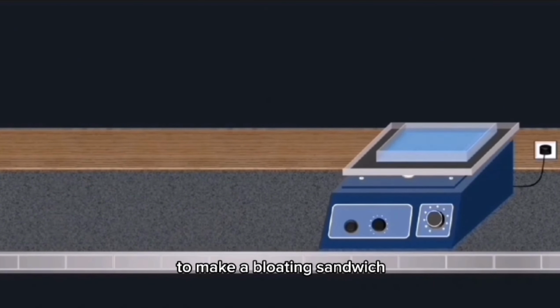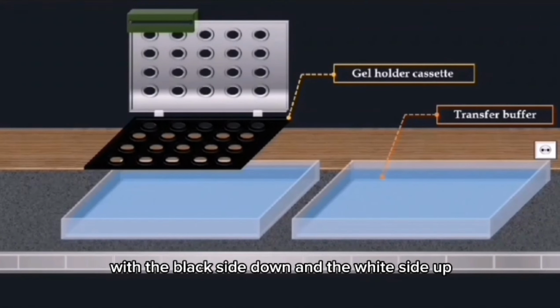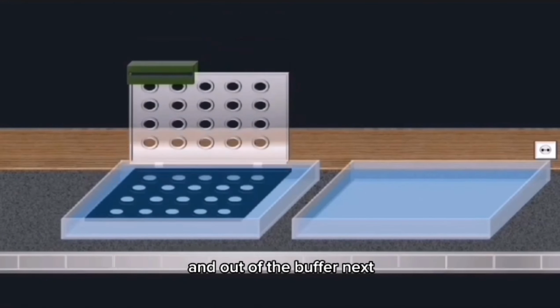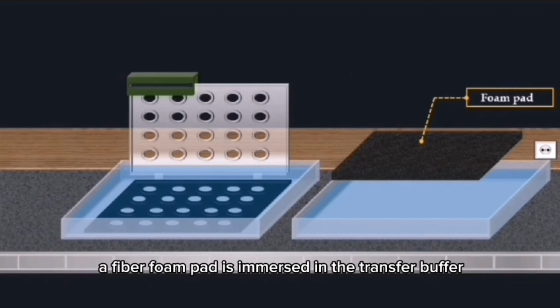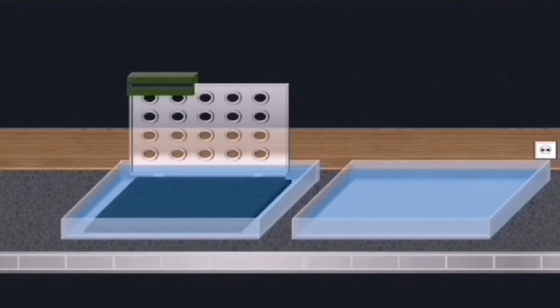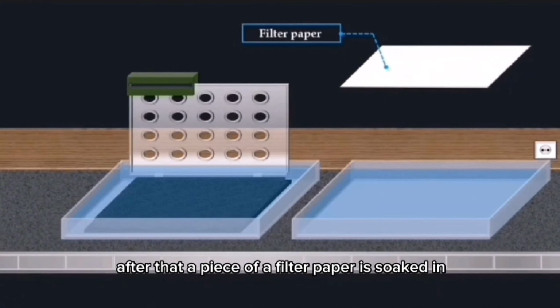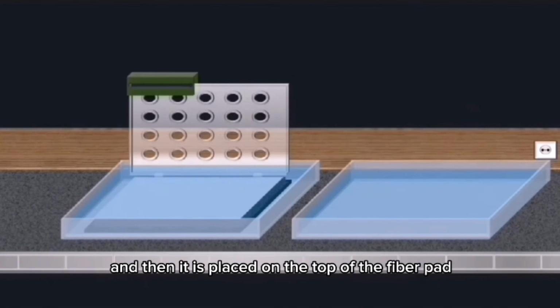To make a blotting sandwich, a gel holder cassette is immersed in the transfer buffer with the black side down and the white side up, and out of the buffer. Next, a fiber foam pad is immersed in the transfer buffer. Then it is laid on the black side of the gel holder cassette. After that, a piece of filter paper is soaked in the transfer buffer, and then it is placed on the top of the fiber pad.